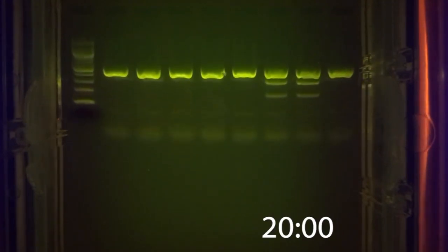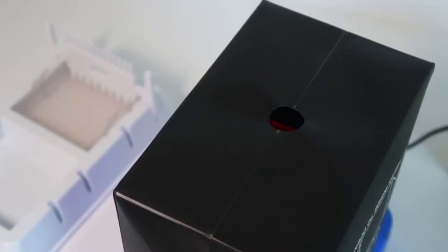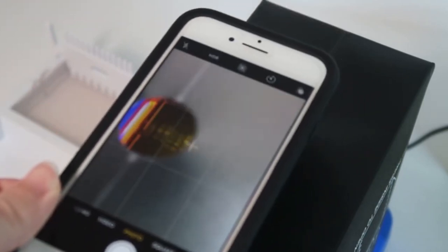Because the electrophoresis system and transilluminator are built into one device, you can see fully resolved bands in as little as 20 minutes. With the included FolderView image hood, you can record your results using your smartphone.